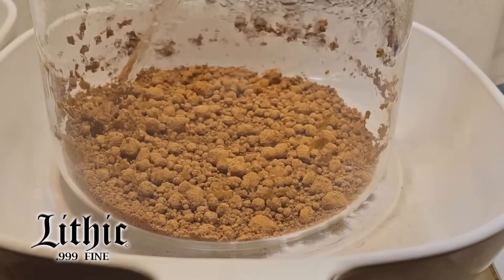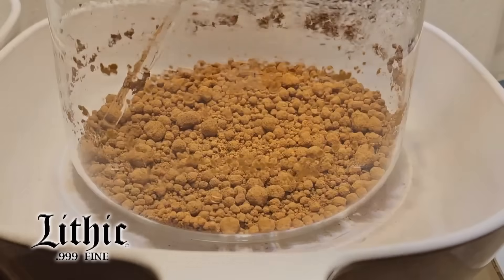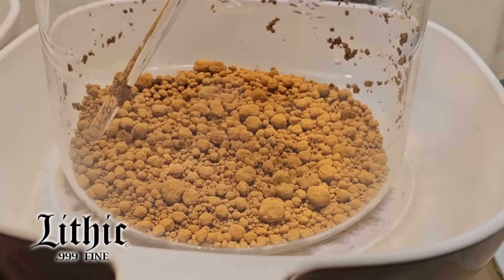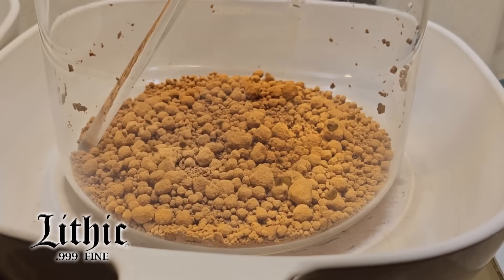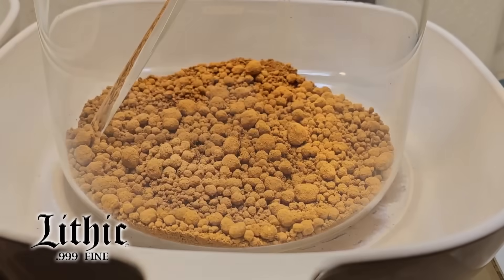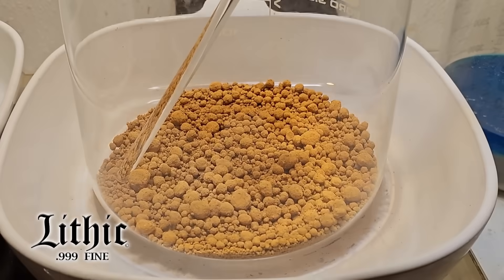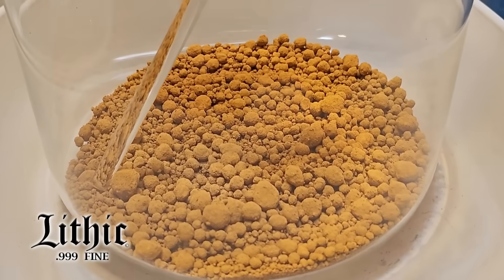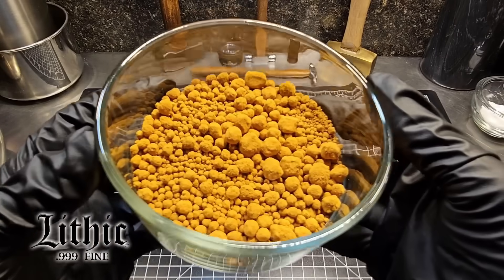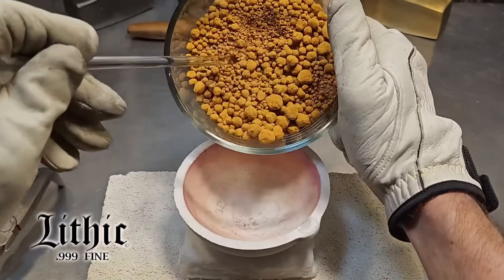Right in the beaker I'm going to dry it off. You see all that stuff clinging to the sides — that's all gold. As it dries, that's my indicator that moisture is starting to get out. I'll see all that stuff clinging to the sides start to fall, which tells me there's not enough moisture to support it anymore. Once the precipitated gold powder is all dried, here's what we're left with — nice, bright, clumpy.